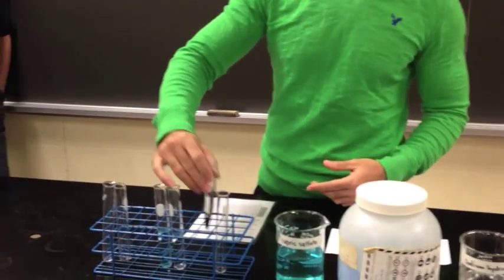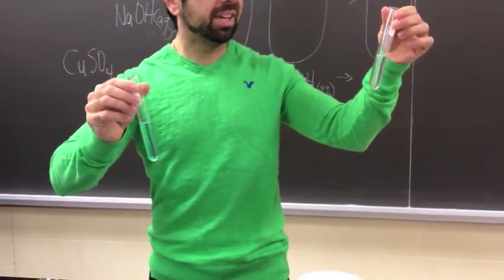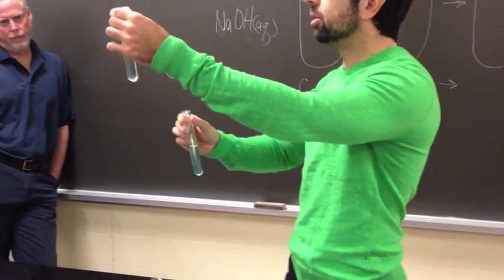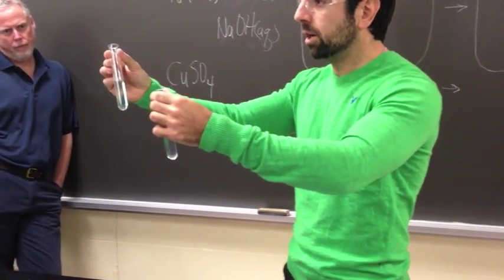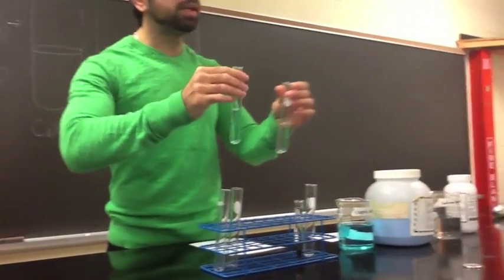So notice here now that we've got two liquids, two aqueous solutions. Literally, it looks almost like it could have been water and water with a little bit of food coloring. The way we're convinced that's what it could be. But when I mix the two together.